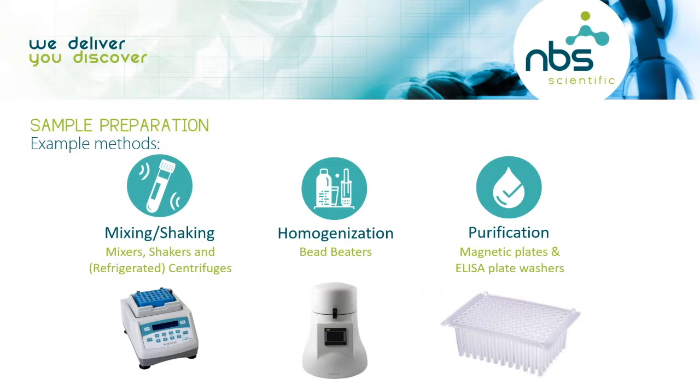It will shake up your sample much better by using the bead beaters. You can get your sample out of your plant cells and get your target sample free.